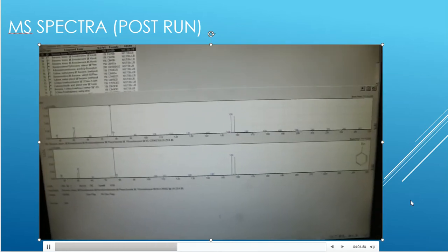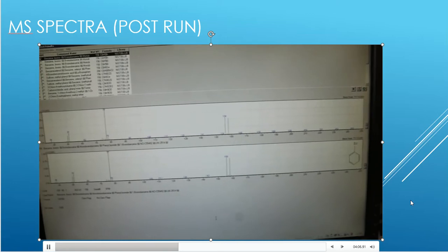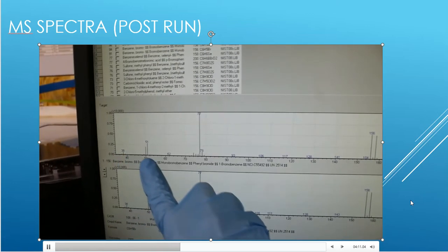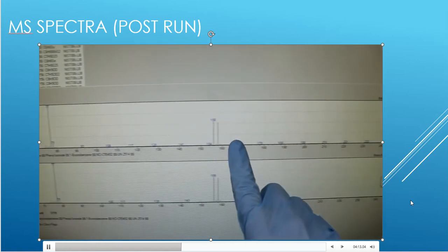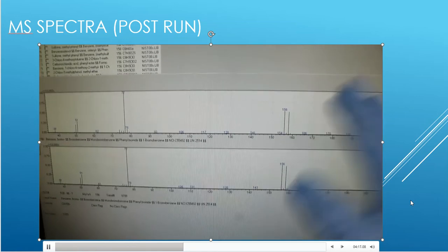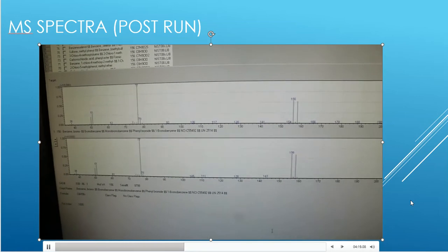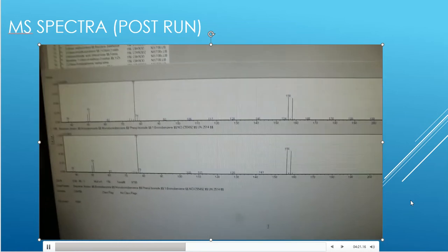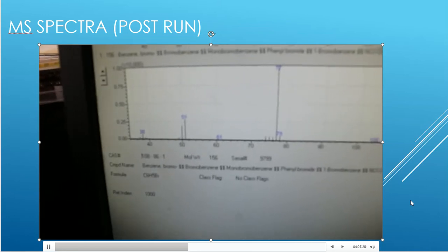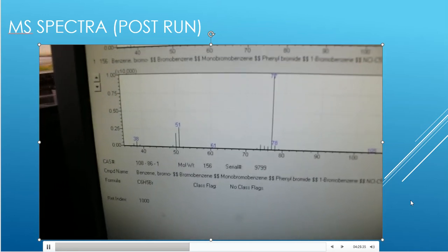That's what we call the database. This database is looking at my mass spectrum, which is right here on the computer screen, that is what my sample obtained. And in a matter of fractions of a second, it matched that to a database mass spectrum that we have in-house. And we've paid thousands of dollars for this database system, by the way, folks.